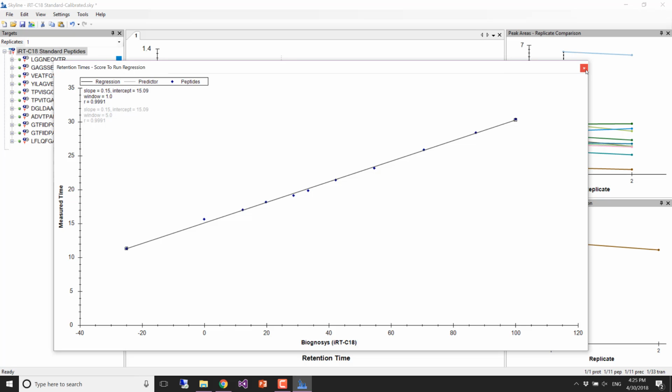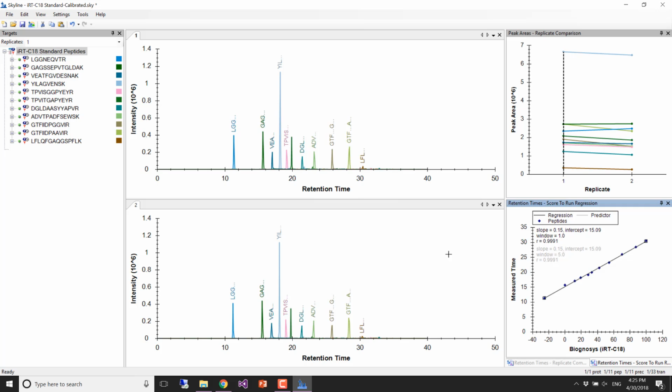All right, so let's go. So now let's pretend that we wanted to, if you pulled this out like I did, which maybe nobody did, you can just put it back by double clicking and then it will pop into its position docked to the window.